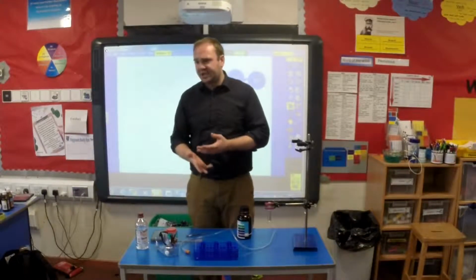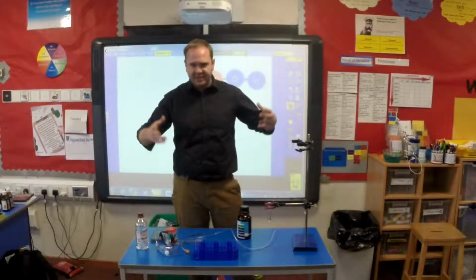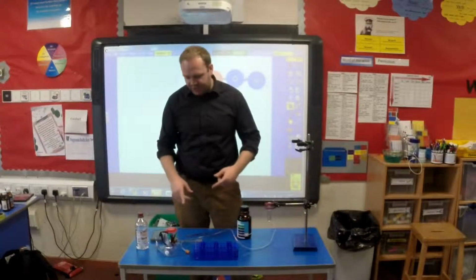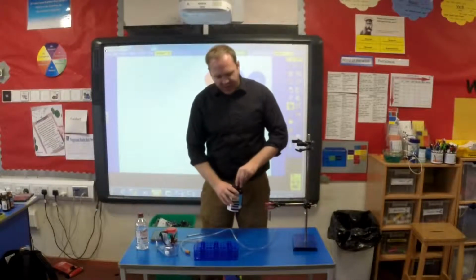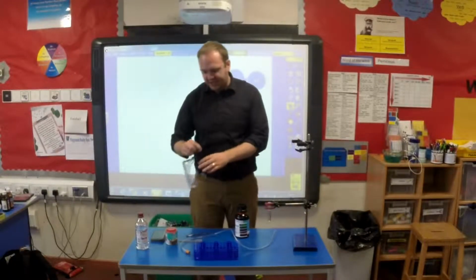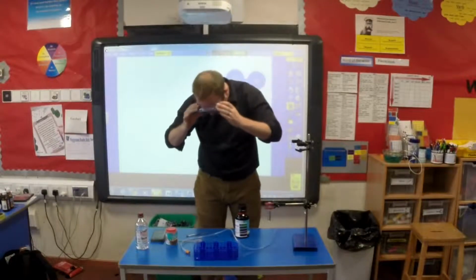And kids will say things like, well, cars, power plants. Excellent, that's exactly what we're looking for. So cars, power plants, man-made CO2. Right, well, that's what we're considering today. I'm going to create some man-made CO2 using a chemical reaction, and we're going to watch what happens to this universal indicator solution. Now, they should be familiar with universal indicator already, because they should have done the previous neutralization experiment.